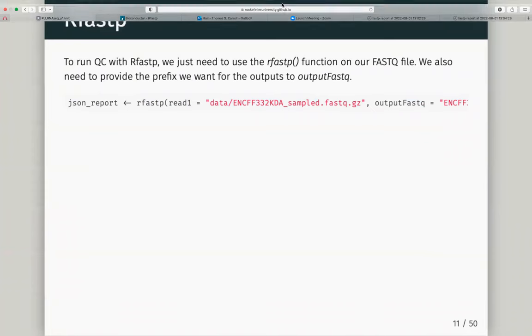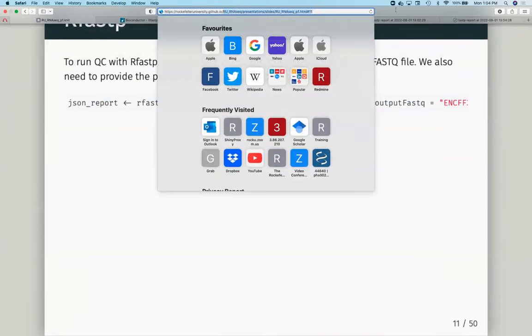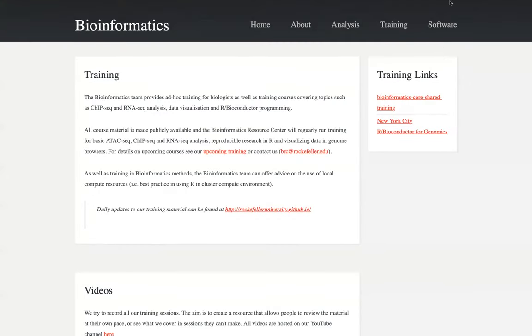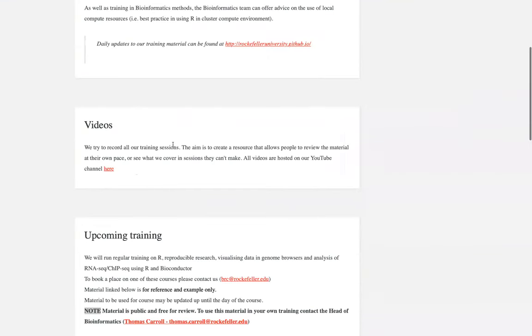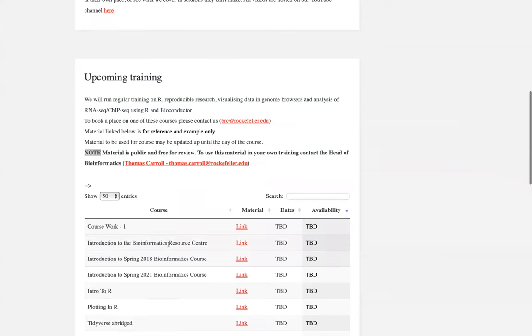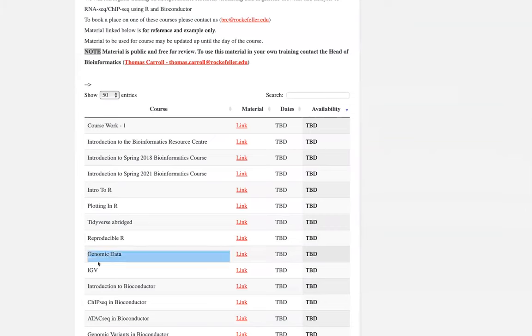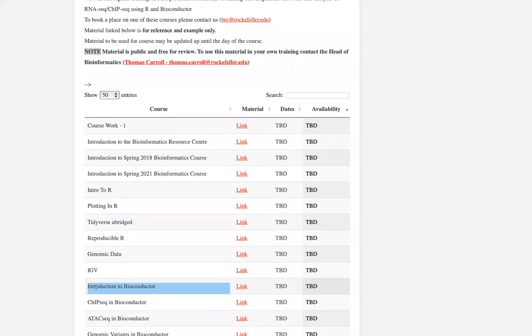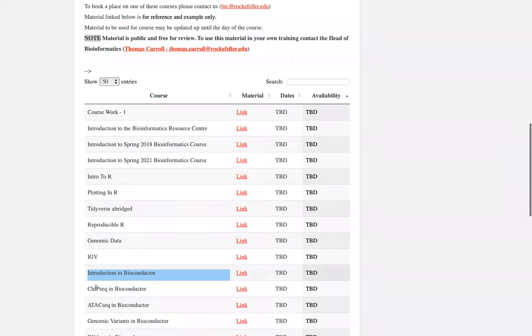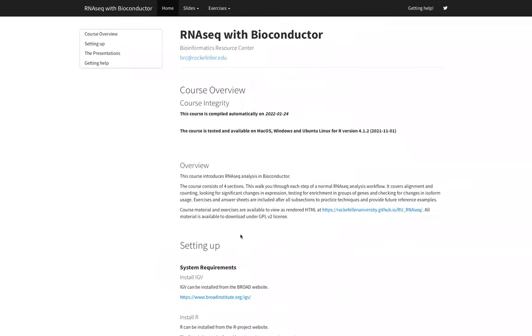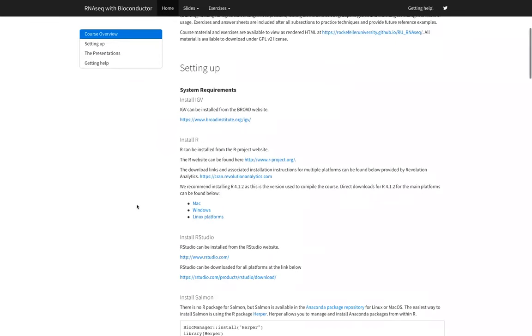We're on our homepage rockefellaruniversity.github.io. We've gotten through our intro to R, plotting in R, a bit of reproducibility using R Markdown. We introduced ourselves to genomic data, the type of data we'll be handling, and how we can review some of that when it's aligned in IGV. We've been working through the different objects needed to handle any type of high-throughput sequencing data. Now we can get started on some actual analysis using real data, and we'll begin with RNA-seq.